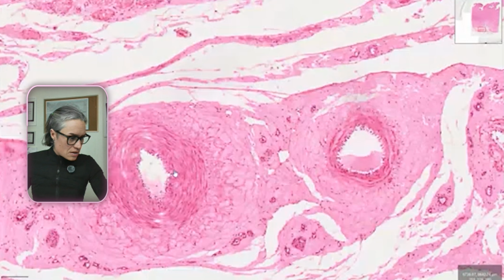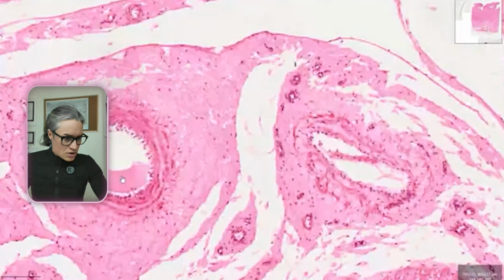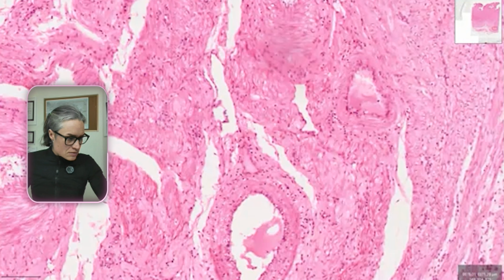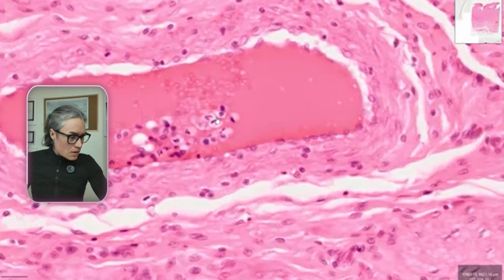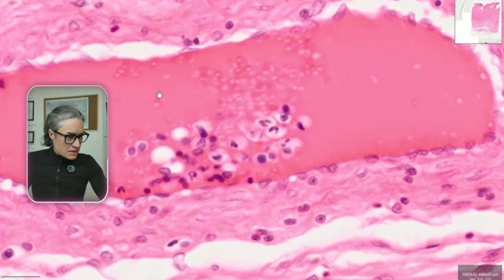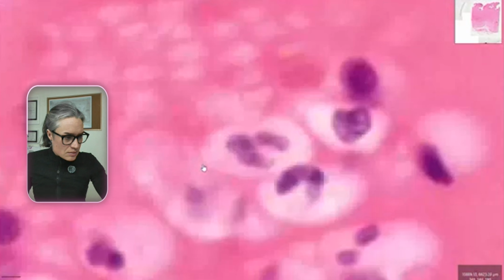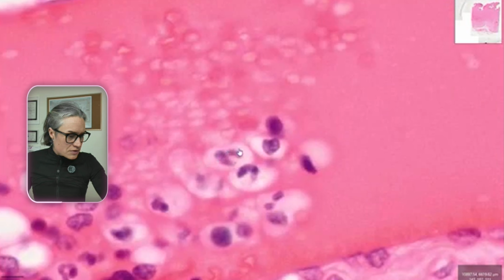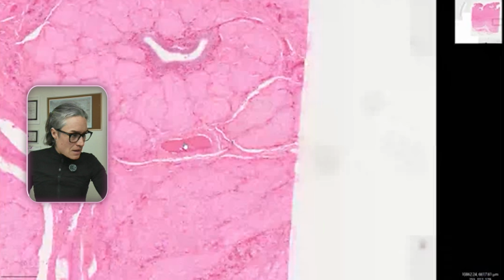This is epithelium. Here are vessels. Let's find, this looks like an artery. We want something with blood. This is just proteinaceous fluid. Nothing, just the fluid. Fluid, nope. Here. Woo! Look at this. The red blood cells are kind of merged and it looks like fluid, but here we can see the white blood cells. These look like neutrophils to me. Here are a couple of lymphocytes. These could be monocytes. Not too bad.